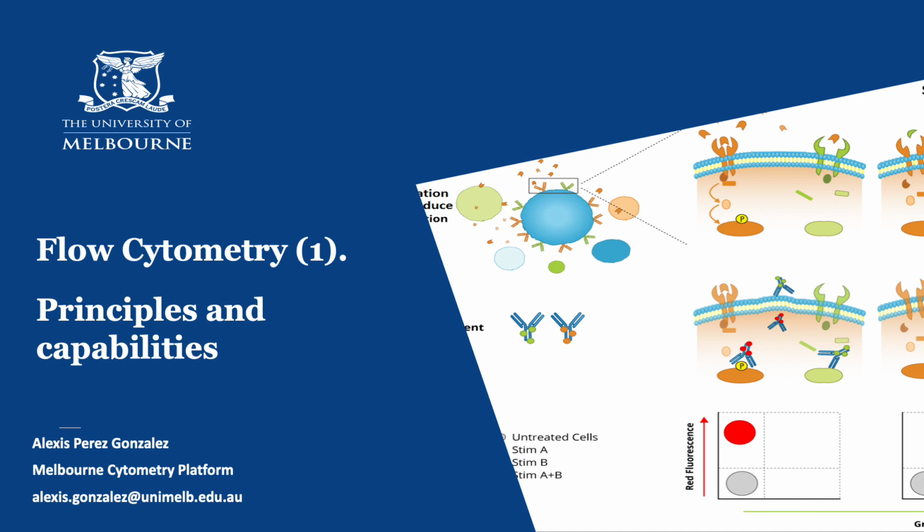So the lecture today is part of a two-lecture series in cytometry meant to be an introduction for new users. It's slightly basic at the same time. It's a little in depth in a way for an intro lecture, but I think it's important because providing all these details will help you to understand the technology, the capabilities, but also the limitations.